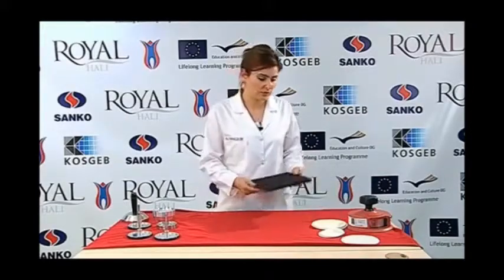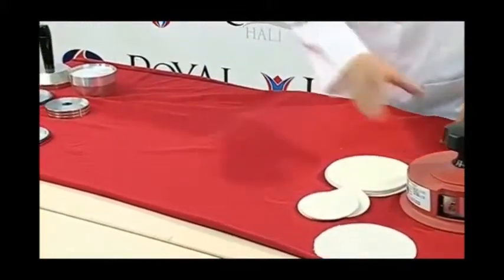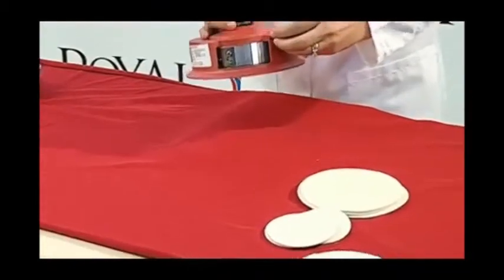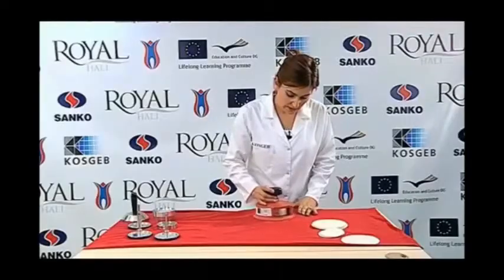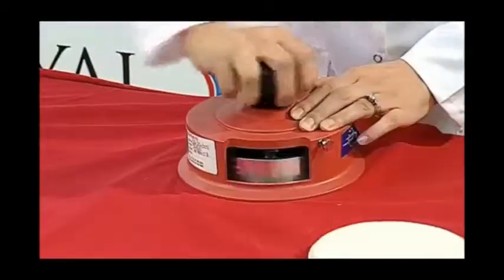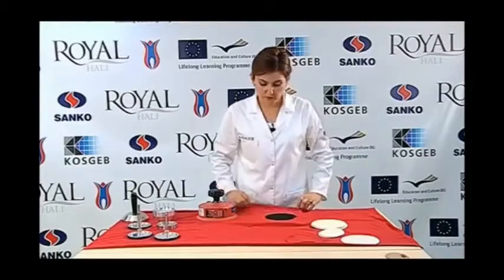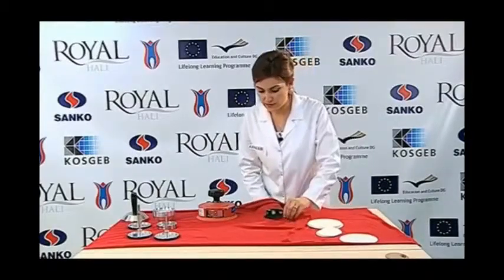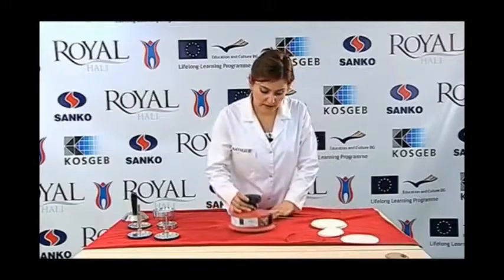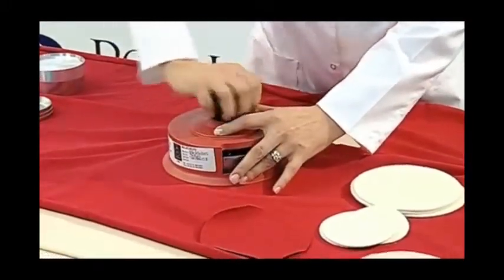We lay the sample on a flat surface. We cut the sample at least 150 mm from inside the edge of the fabric. After placing the sample on the bottom tray, we cut a 140 mm diameter sample with the sample cutter. We cut knitted and woven fabrics as abrasive fabrics and prepare 3 pairs of samples randomly, exhibiting all characteristics of the specimen.